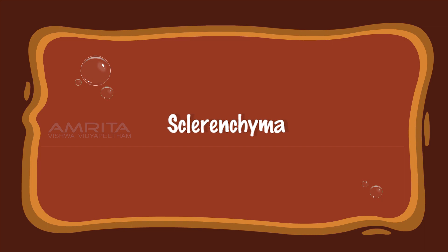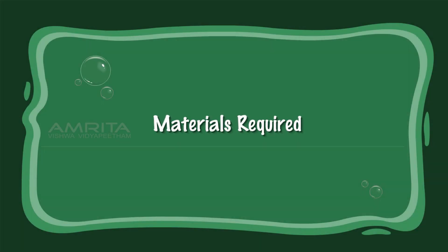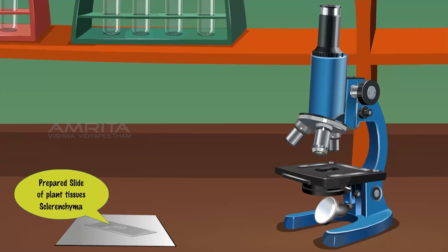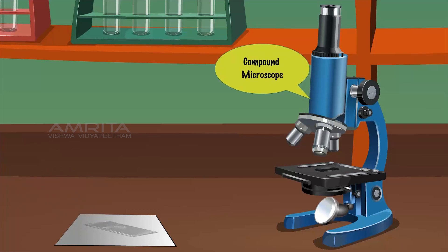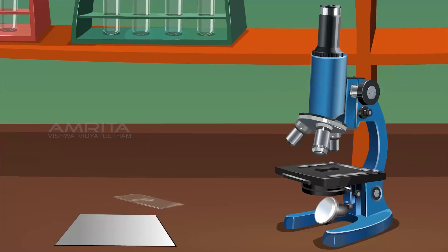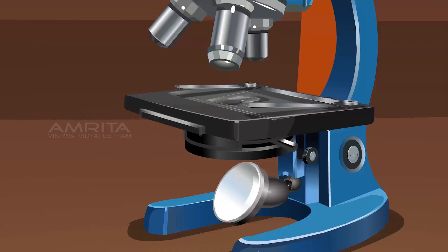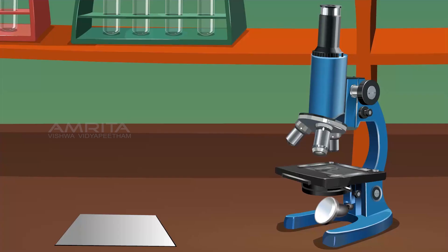Sclerenchyma. Materials required: prepared slide of sclerenchyma tissue and a compound microscope. Procedure: Place the prepared slide of sclerenchyma tissue on the stage of the compound microscope. Observe the features of the sclerenchyma tissue through the lens of the compound microscope.